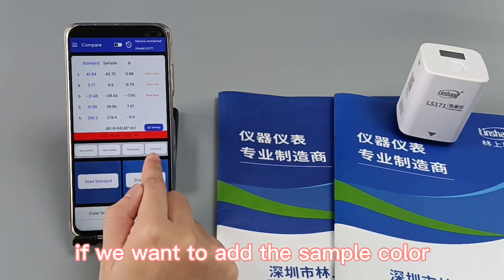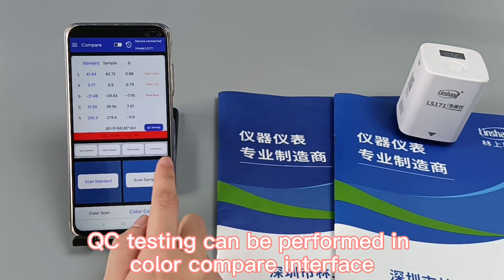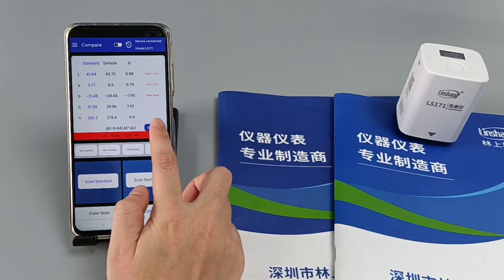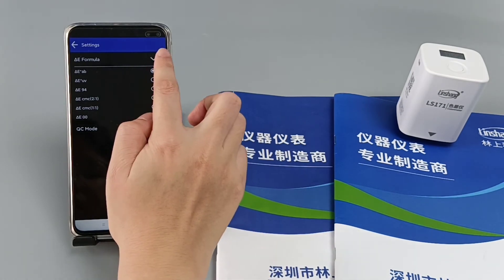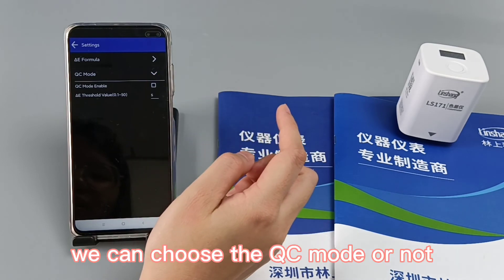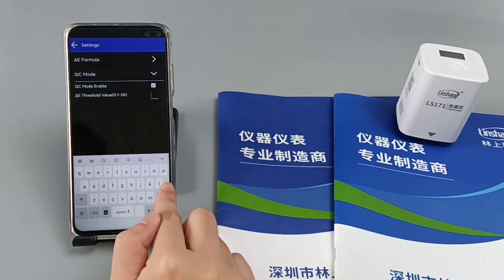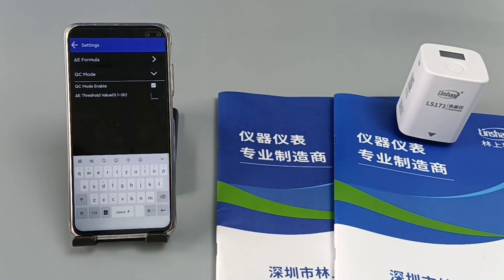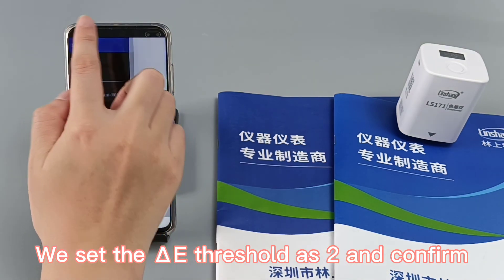If we want to add a sample color, the operation is the same. QC testing can be performed in the color compare interface. Click ΔE setting and select QC mode. We can choose QC mode or not. For the ΔE threshold, we can set a value from 0.1 to 50. Here we set the ΔE threshold to 2 and confirm.